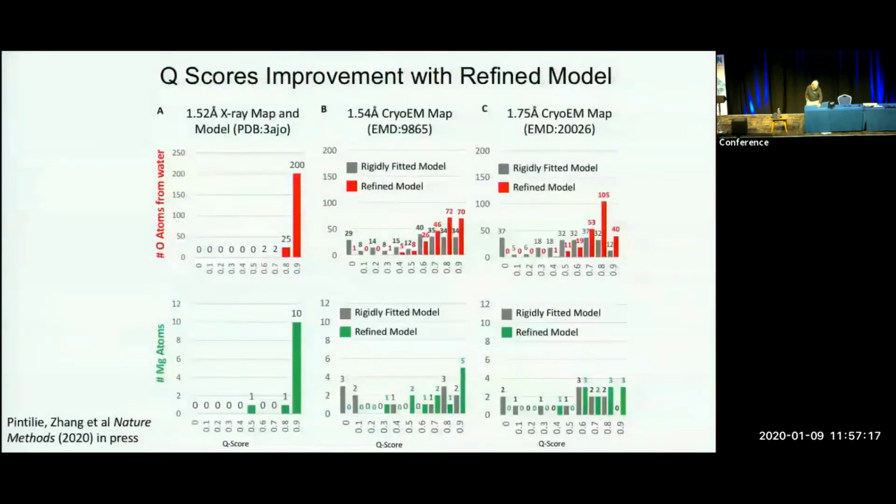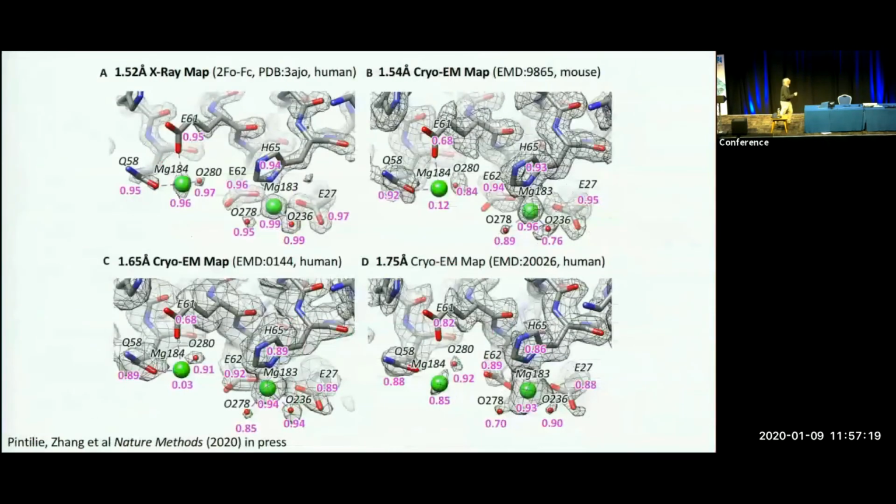And then I just want to show one more slide to demonstrate again the resolvability in a different map, and this is an X-ray map. They have a metal atom. We do see all the metal atoms. The red ones are the water, and these are really good water in here. But interestingly, this particular metal atom does not show up as well. So by and large, all the metal and water agree well between most parts of the density. Now, these are the protein.